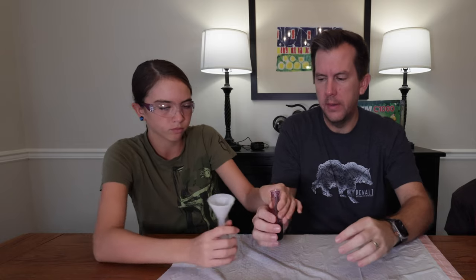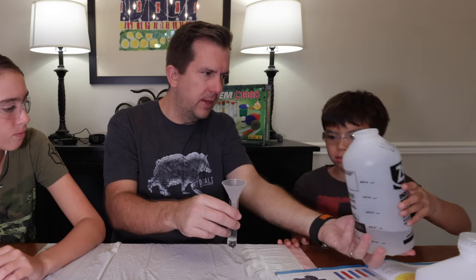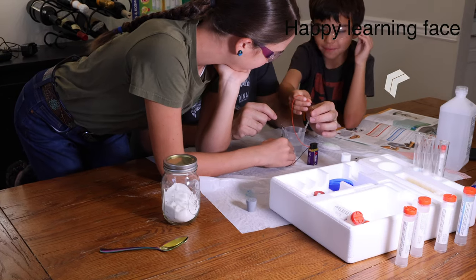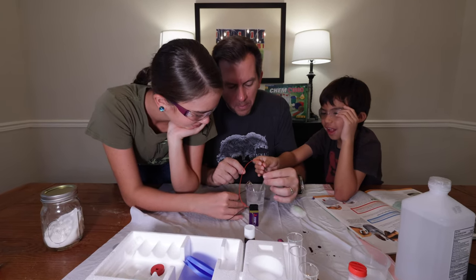Other experiments we performed were the classic acid-base reactions using a litmus solution and watching the color changes as different acids and bases were added. We did experiments using heavy metals and the different properties of elements depending on the compound they're in. We also did an electrolysis of water experiment where you break down the water molecules into their individual oxygen and hydrogen atoms — your kids will actually be able to visualize the oxygen and hydrogen gases being formed.